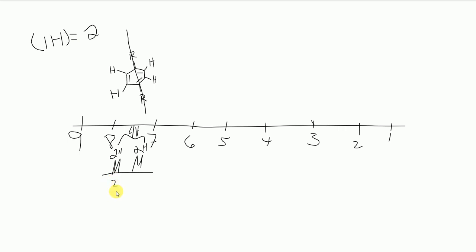So I have 2 peaks here, and this is why I have that. Okay, so a total of 2 hydrogens because these are both the same. That's why the integration number is 2, and then the multiplicity value corresponding to this one is just 1 plus 1. Okay, and it's reflected on both sides. So both sides have this. This one is unique, and this one is unique. This is not unique. This is not unique. So I have hydrogen A, hydrogen B.